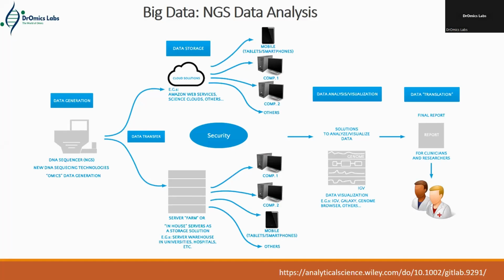Again, then there is a database, for example NCBI's SRA, where you can submit your FASTQ sequences generated from NGS data analysis. And I hope you know FASTQ, because in yesterday's session, the FASTQ format was covered.